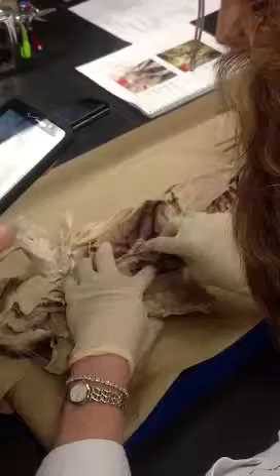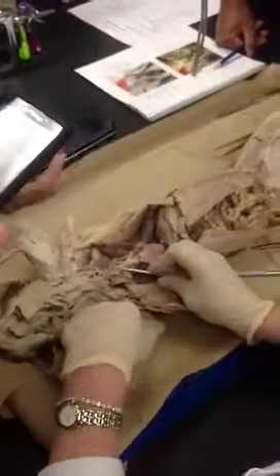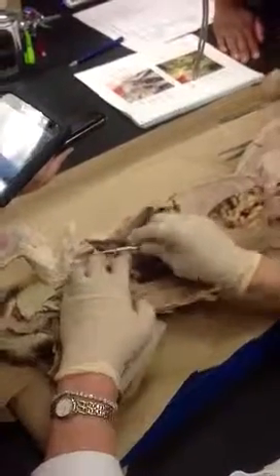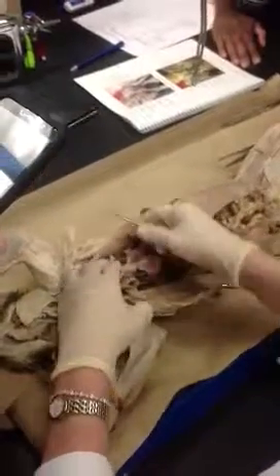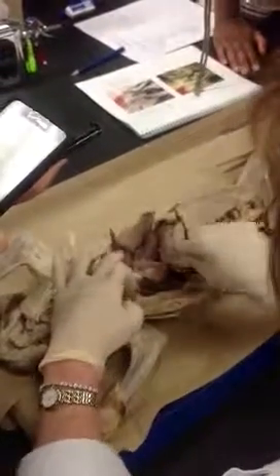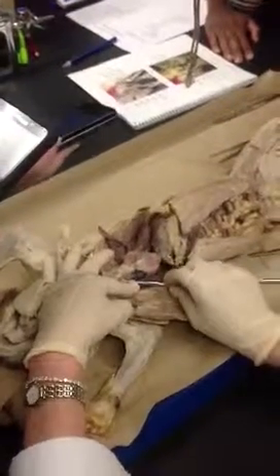And there's 2 vessels coming off of the aorta. This one over here to the cat's right, and this one over here to the cat's left. There's 3 in humans, just 2 in cats. There was the biggest one, okay, which we don't need anymore. Okay, so here we go, just 2 vessels. That's it.